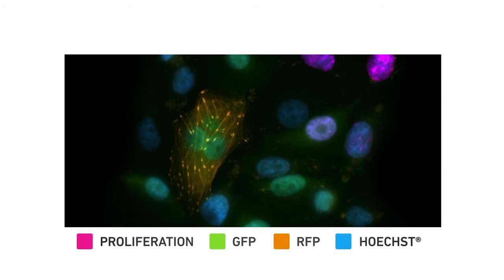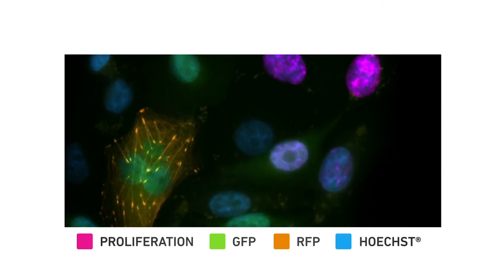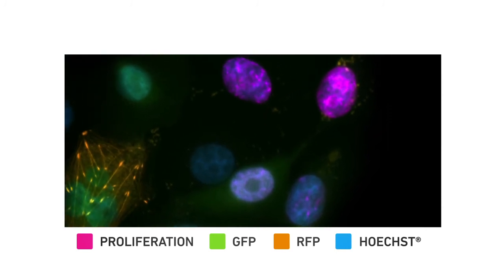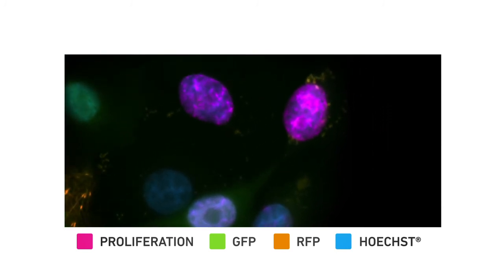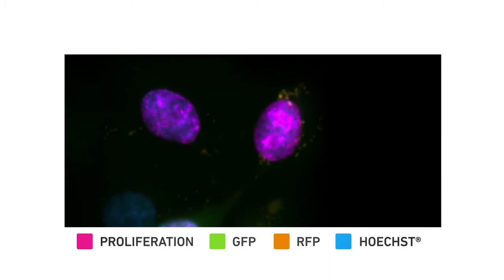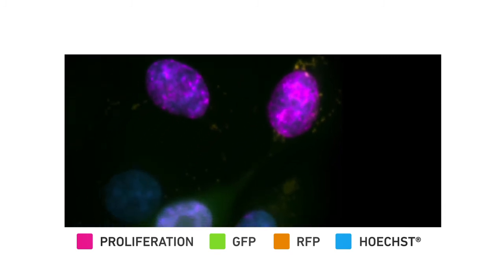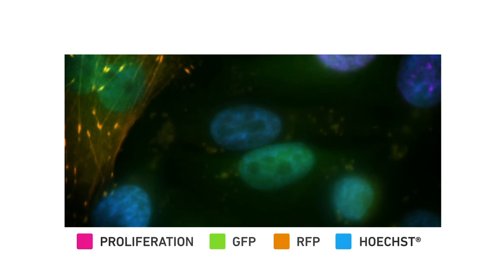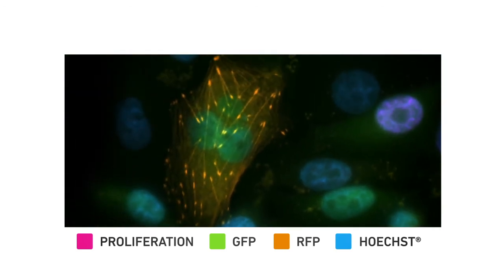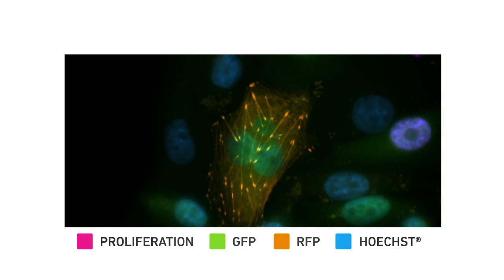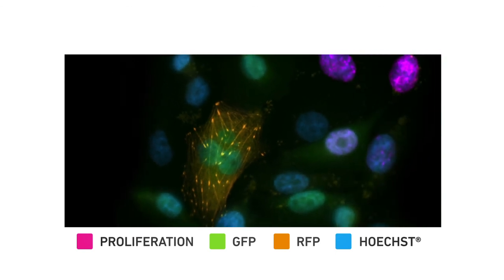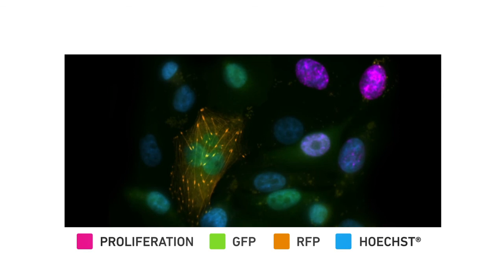In this example, melanoma A375 cells constitutively expressing green fluorescent protein, or GFP, were treated with the Click-IT Plus EdU AlexaFluor 647 imaging kit. Newly synthesized DNA appears pink. The constitutively expressed GFP is displayed as green. Nuclei are blue due to Hoechst staining. Talin is stained with an RFP fusion protein. Because the cell morphology is maintained, four fluorescent signals from one population of cells can be detected.